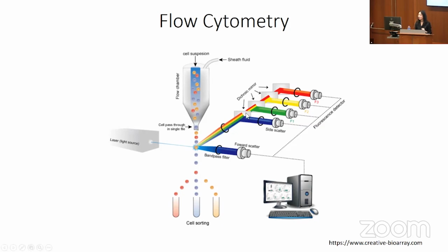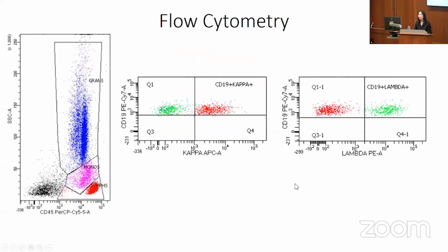And then there also is the part where you see the fluorescence of these different antibodies to the cells, and it gets collected, and what results is this. So we interpret that as well. Here is CD45 against side scatter. So it splits out these cells very well. And this is actually the kind of technology that is used in the CBC as well, right? So you have lymphocytes here, which is high on CD45 and low in complexity, which is what side scatter does.